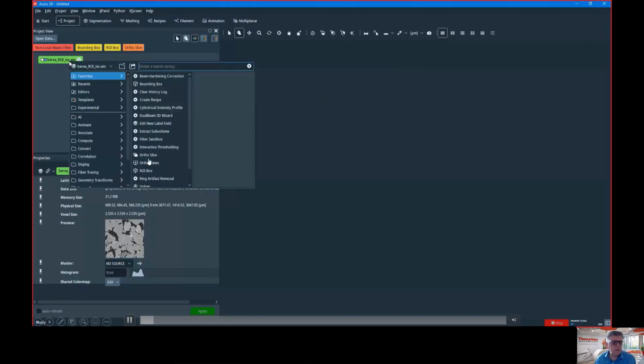And the first natural thing you want to do is to view the data. So how do you do that? In some cases you get an automatic visualization, but if it's not the case, you right-click on it, and you get a huge list of modules. This is all the modules that can apply to a cube of voxels. So you can imagine you can do anything with it, like rendering, computing, and so on. For convenience, there is a category called favorites, in which you have the most used modules, computation or rendering modules, doesn't matter. It's a list of modules.